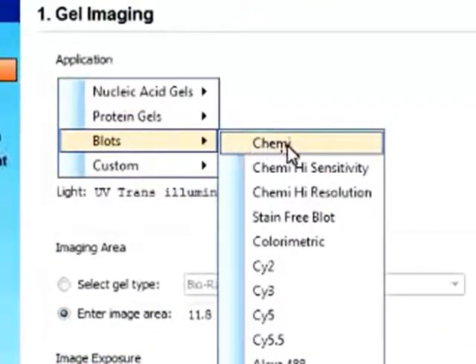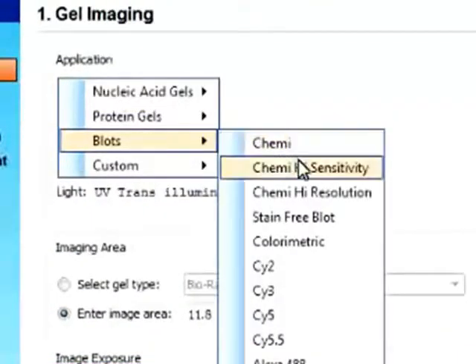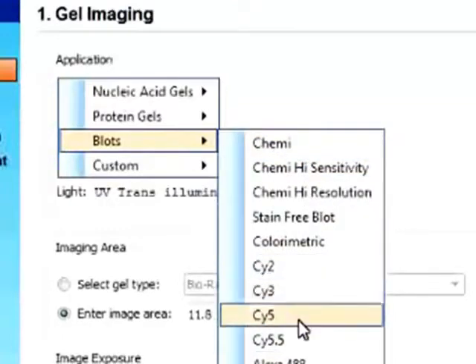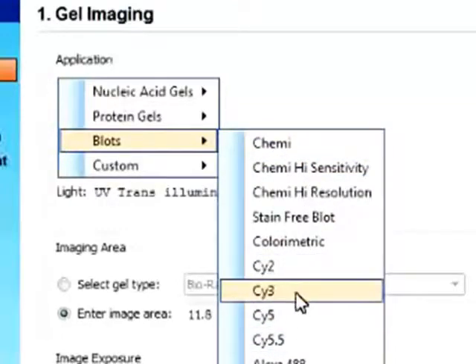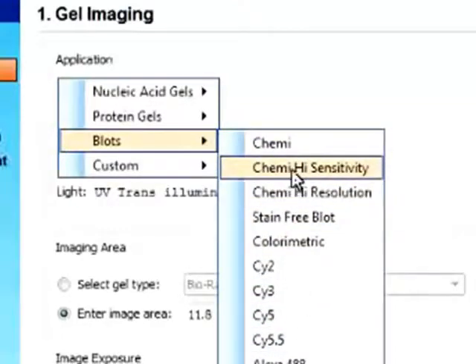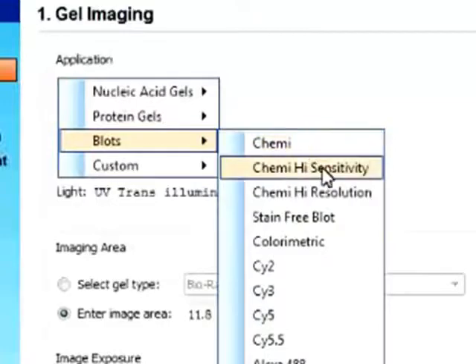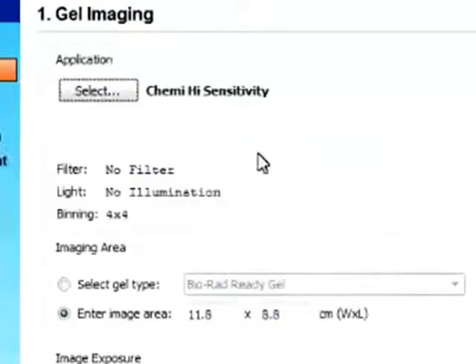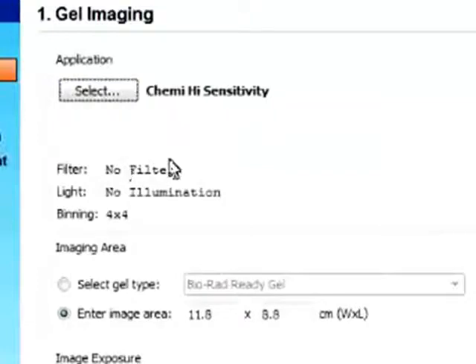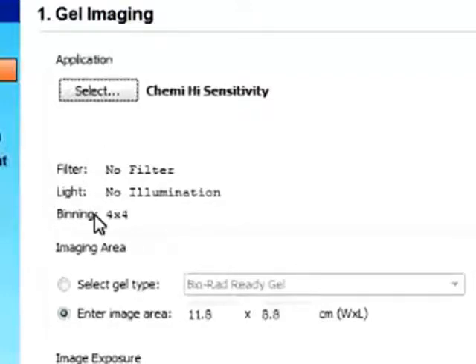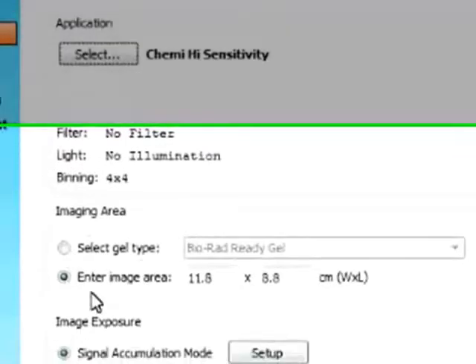So say if we want to look at a blot, we can either look at a chemiluminescent blot or fluorescent labeled blot. Say if you want to look at a chemi with high sensitivity, you can see there is no filter and no light source, so no illumination with chemi. So basically this is automatically set.